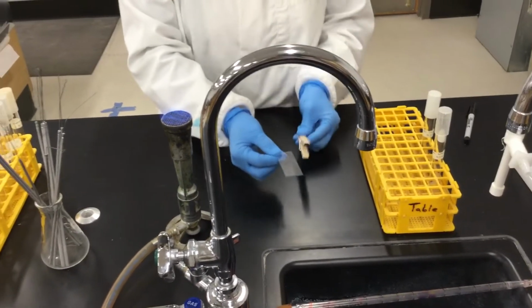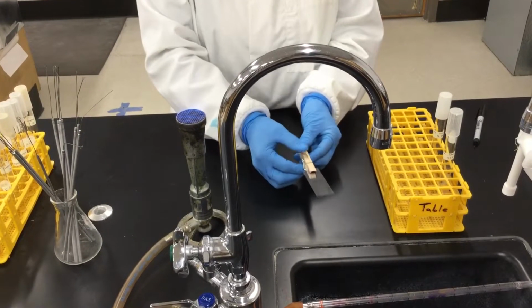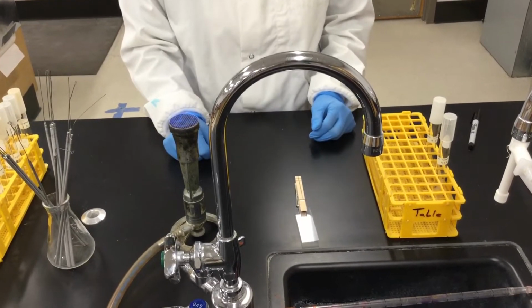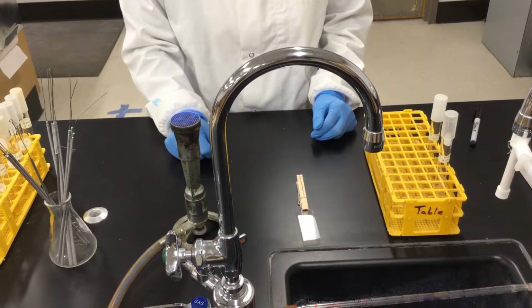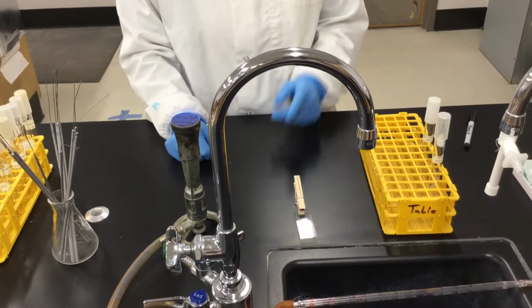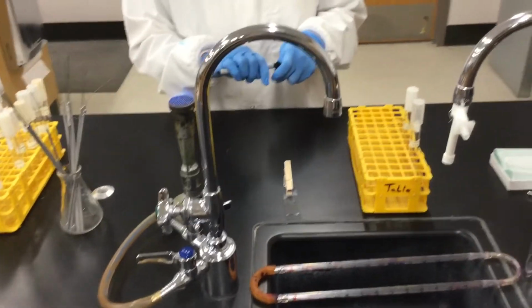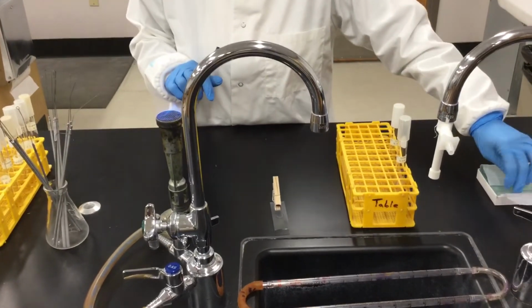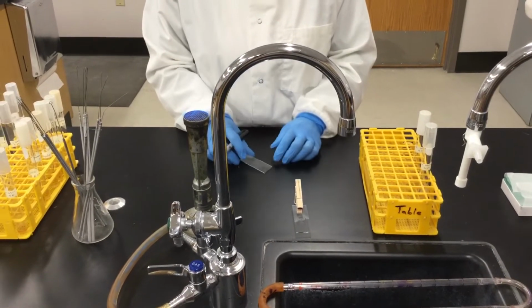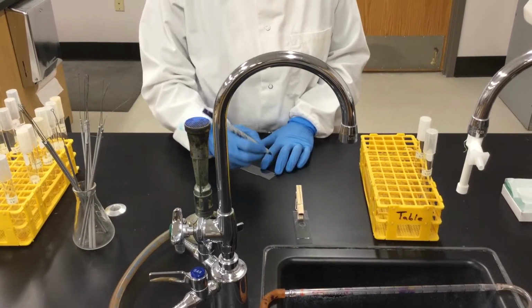Another thing that you can do meanwhile is grab it with a clothespin like this, and let it stay until it's completely dry. And as this is happening, I'm going to label my other slide for the solid media, the slant. And that's something that you can learn as well. While you're waiting for some things, you can start doing other things.